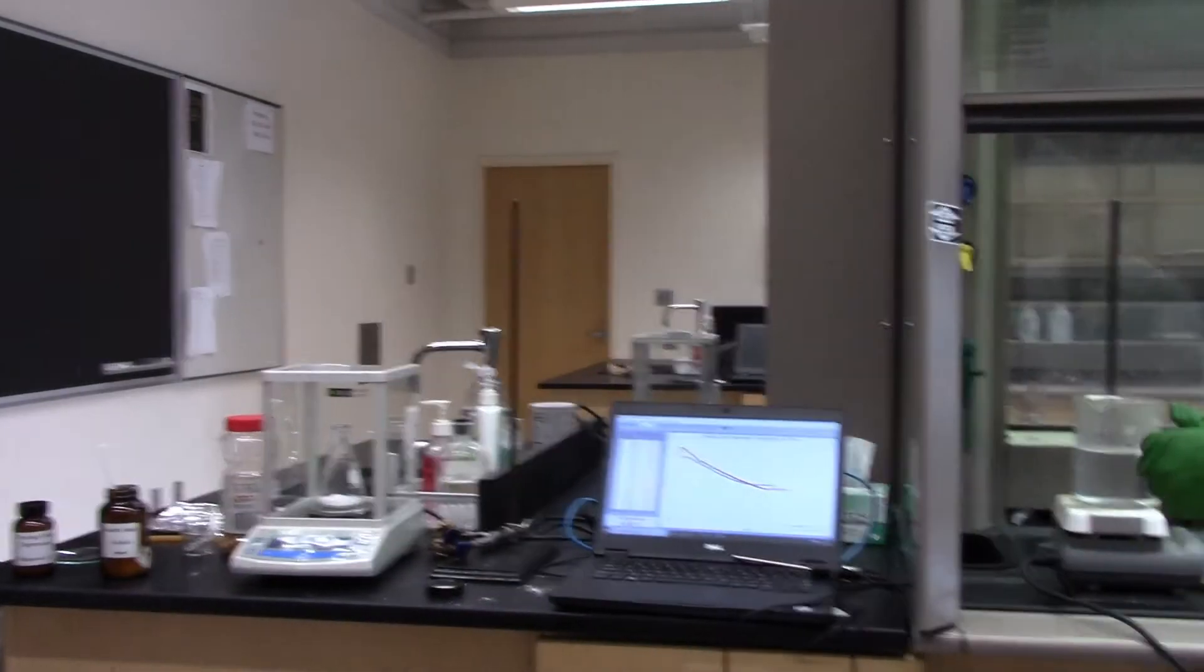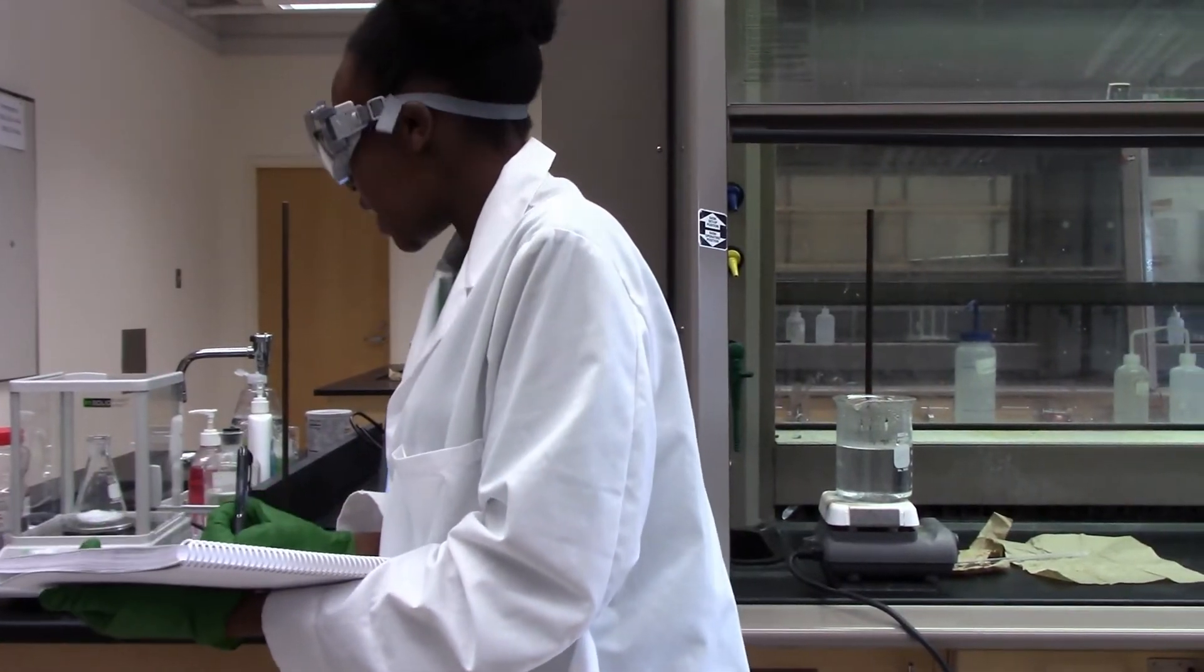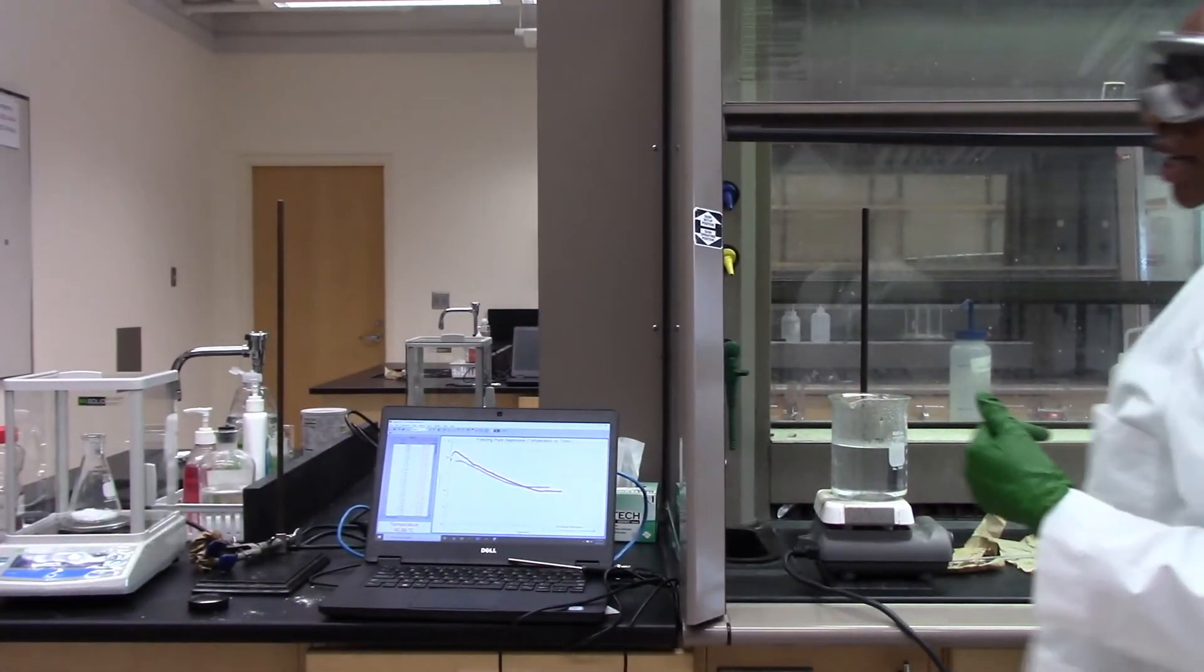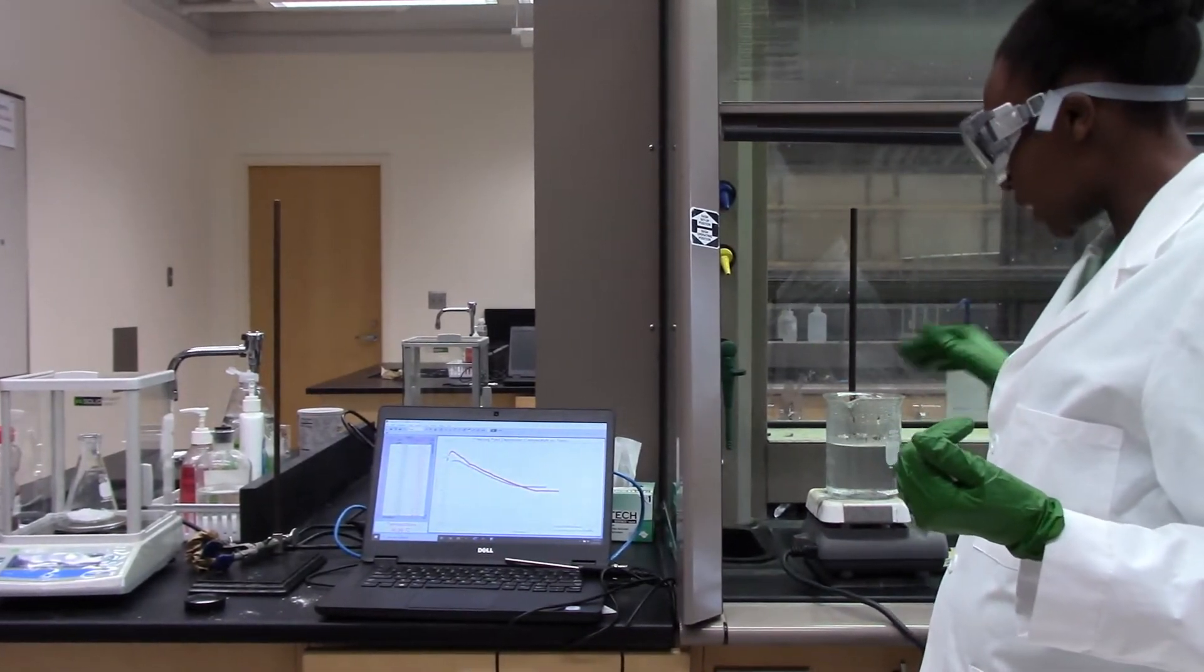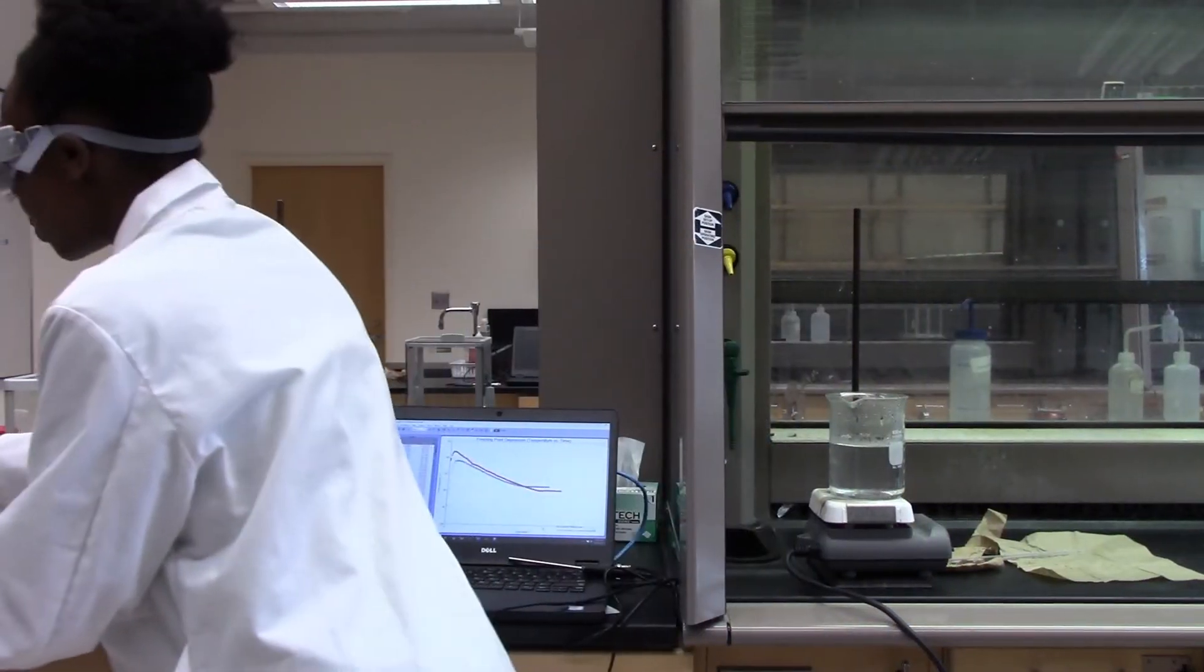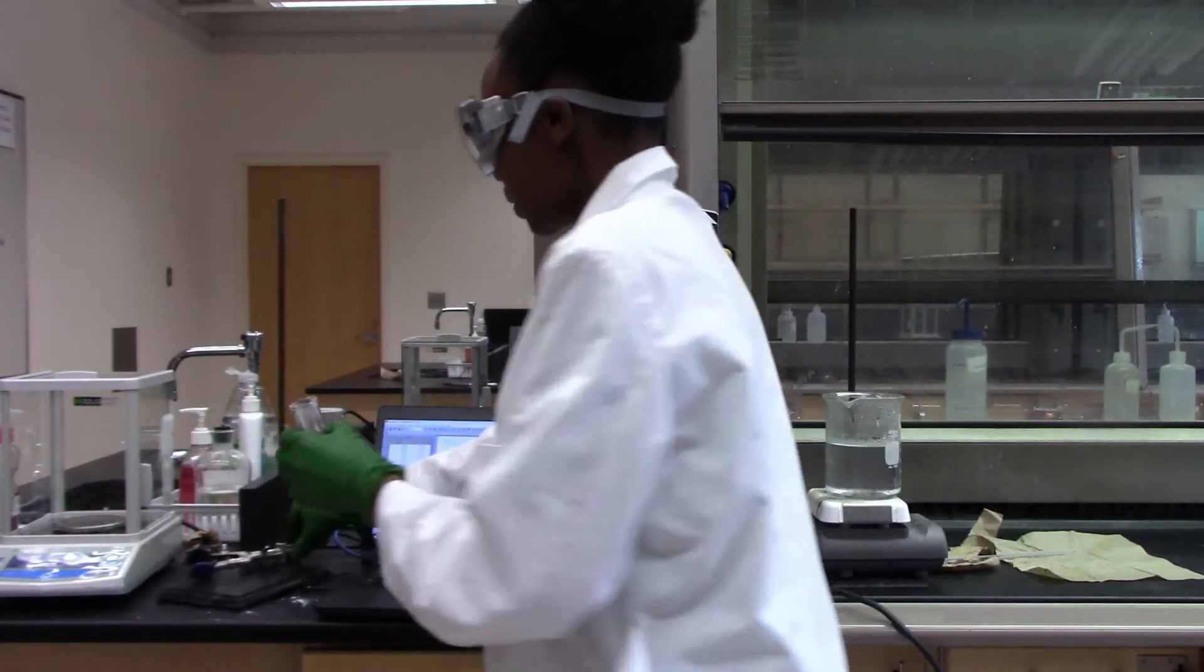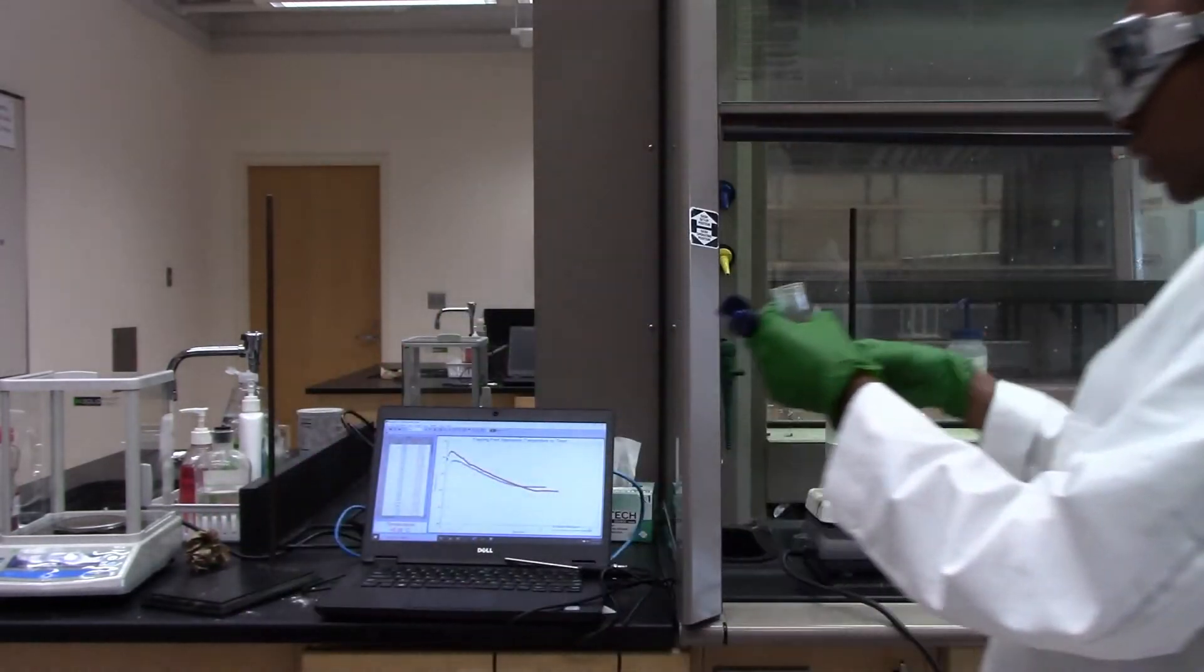Okay, so we have our flask and I added some lauric acid and the mass is 94.359 grams. And now what I'll do next, I have my water bath here started. I put some water in this beaker here and I heated it up. So I am going to place my flask with pure lauric acid into the water bath and melt it.